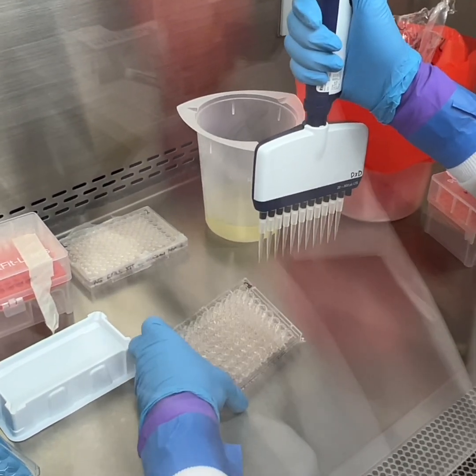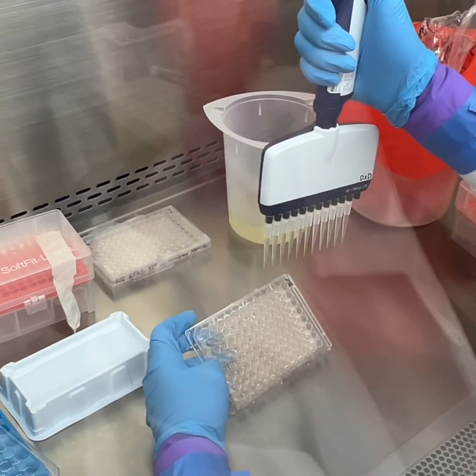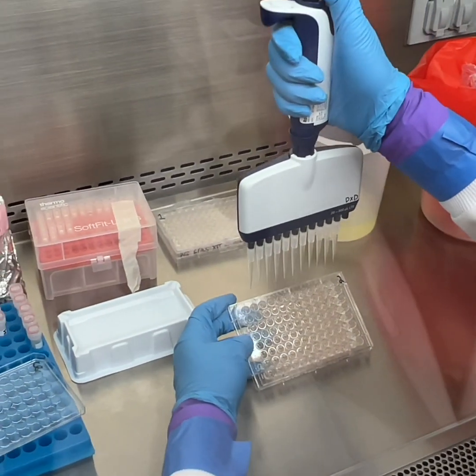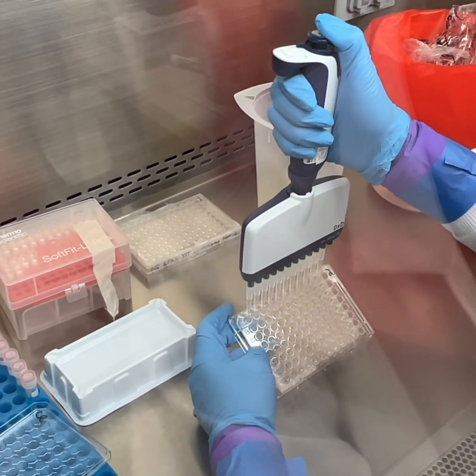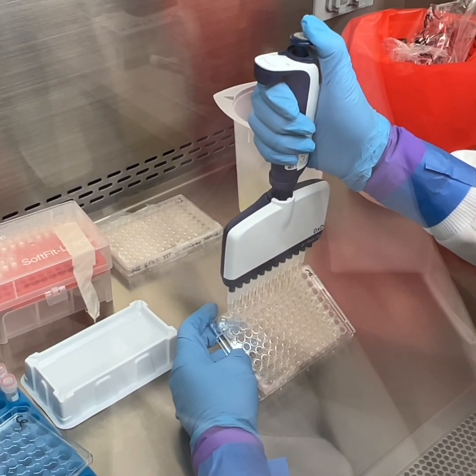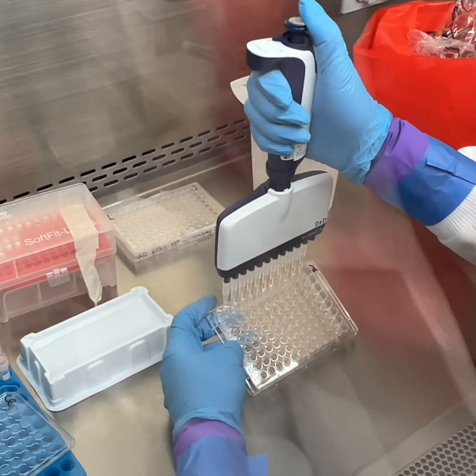So I like to pick it up and tilt it, and just be careful not to drop it. Then I go straight down and aspirate. Straight down, just get as much as you can.